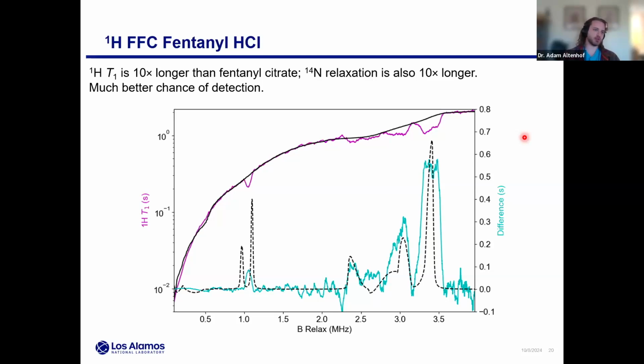As far as the other tricks we play to enhance signal, this might be introducing a magnetic field to do cross polarization, or just going to lower temperature, like cryogenic temperatures, will help a lot. These are very simple additions that are already implemented at certainly high field NMR, and would just be easier on our benchtop devices. So I think part of it is just the runaway commercialization of the Bruker instruments, and a lot of this hardware already exists and is ready to be used.